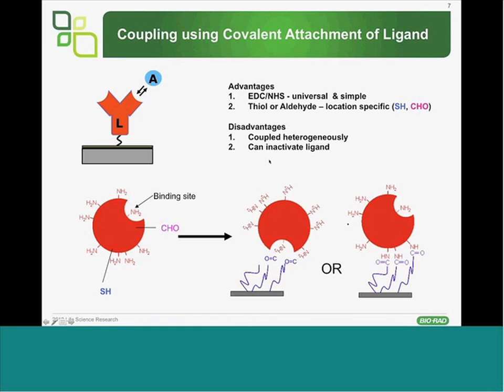An alternative to this would be biotinylation, and this is to some extent an alternative. Why? Because with biotinylation we usually also target a free amine, so in this sense it's the same. We are doing it randomly on any free amine, but instead of capturing through amine coupling to the surface, we take a streptavidin surface, and we can buy a chip that already has streptavidin on it. So in this sense, with both amine coupling and biotinylation, we get the same kind of random orientation of the protein towards the surface.